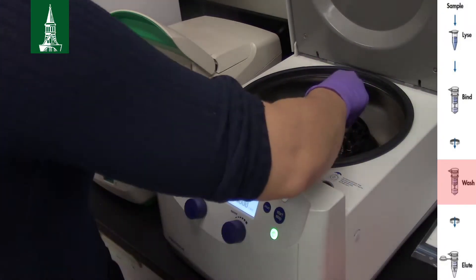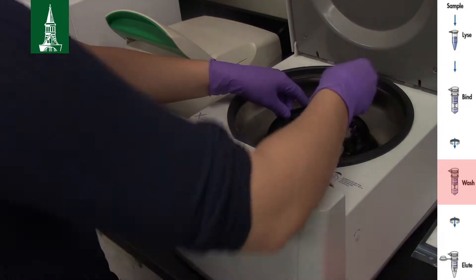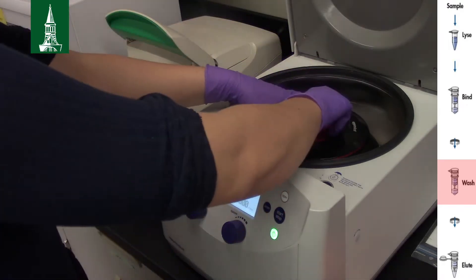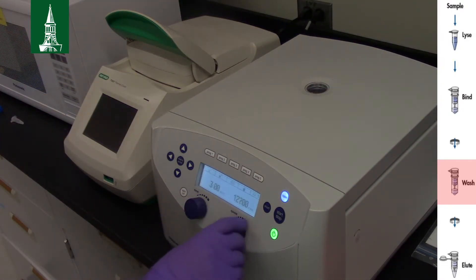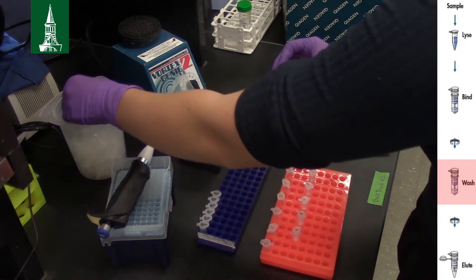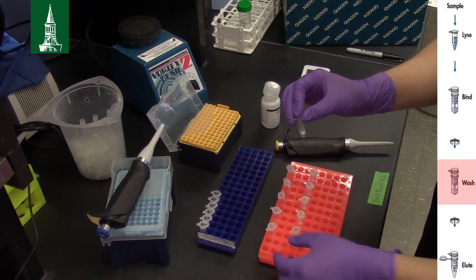Centrifuge at 14,000 rpm for 3 minutes. If your centrifuge can't reach that speed, use the highest setting. Again, discard the collection tube with flow-through, but this time place the spin column in a clean 1.5 ml centrifuge tube.